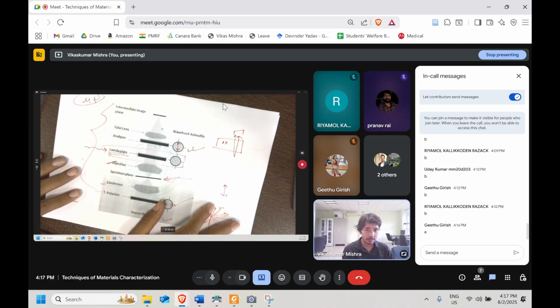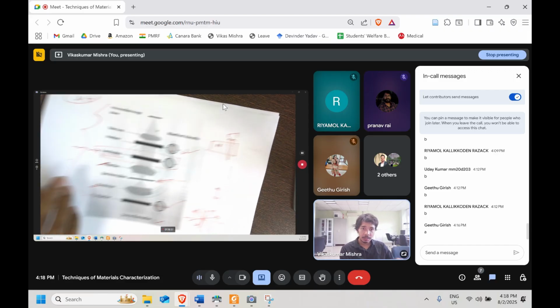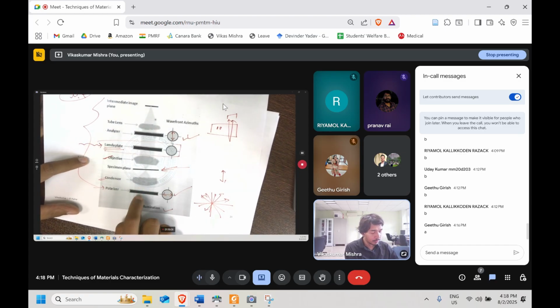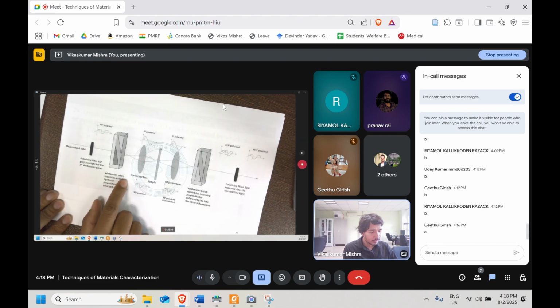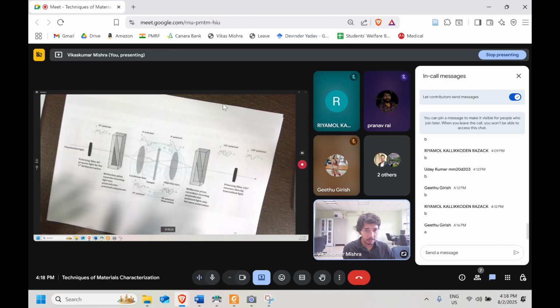which will convert this polarized light microscope to the differential interference contrast microscope, the DIC microscope. Okay, so what are the things? After the polarizer, before the condenser, we are going to put something known as a prism. What prism? It has a particular name. Other than this, there was, Nomarski prism. Yeah, Nomarski prism it is.